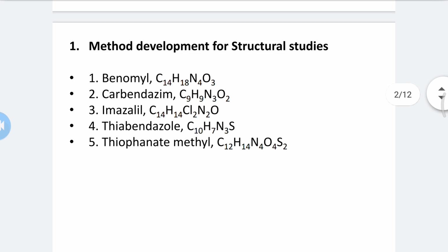Electron spray is a more effective method for compounds of higher polarity than APCI, atmospheric pressure chemical ionization. For example, a method has been reported for quantification.